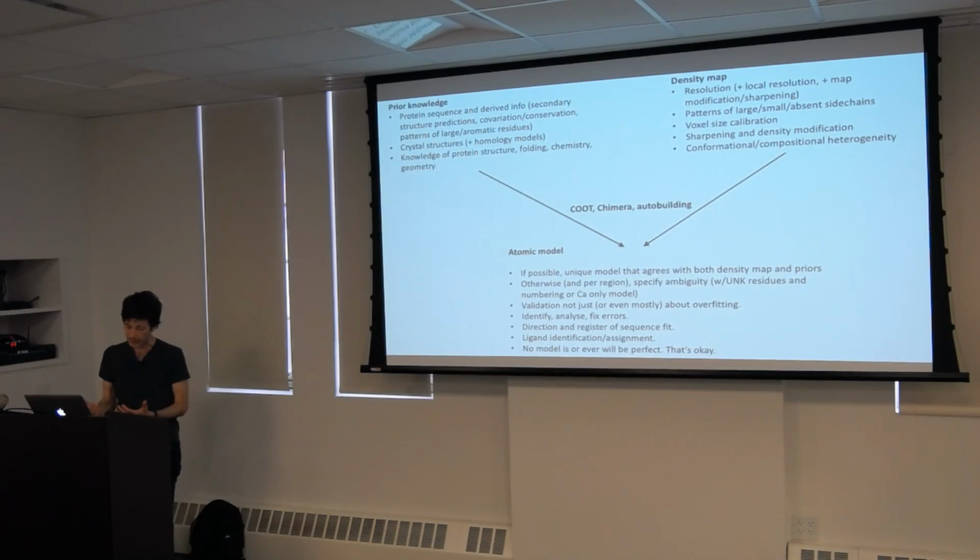And we can also gain quite a lot of information that we can use in model building from analysis of conformational and compositional heterogeneity of the sample. For example, if one subunit in a particular class is entirely missing, that can allow us to assign boundaries for the protomer, which is something that at very low resolution, like 4 or 5 angstroms, can otherwise potentially be tricky.